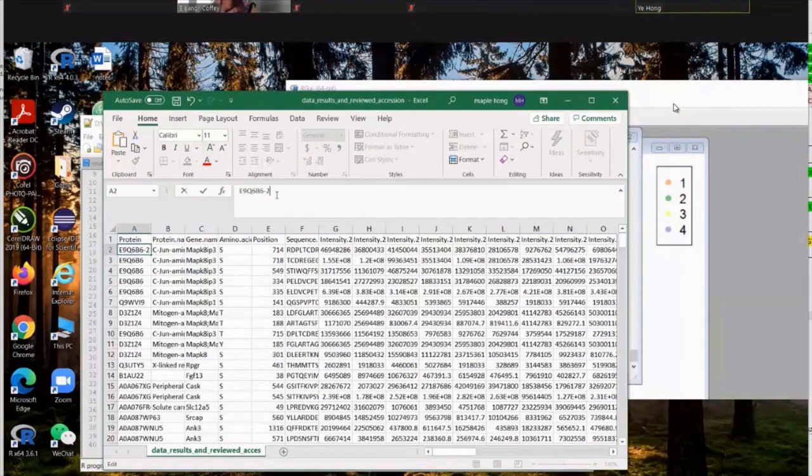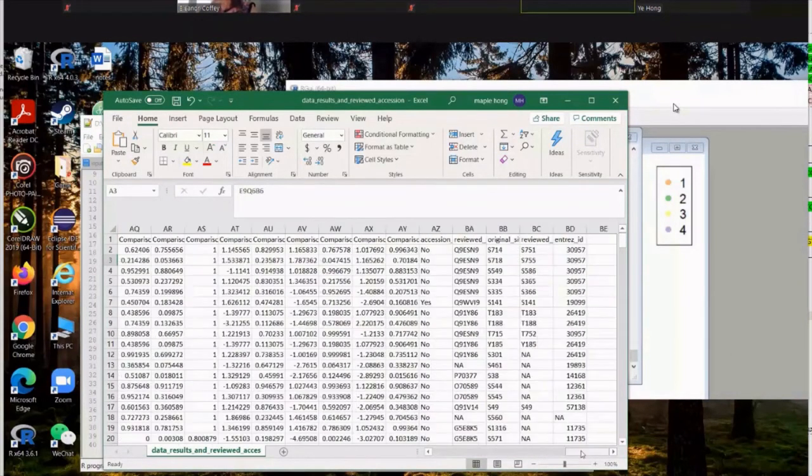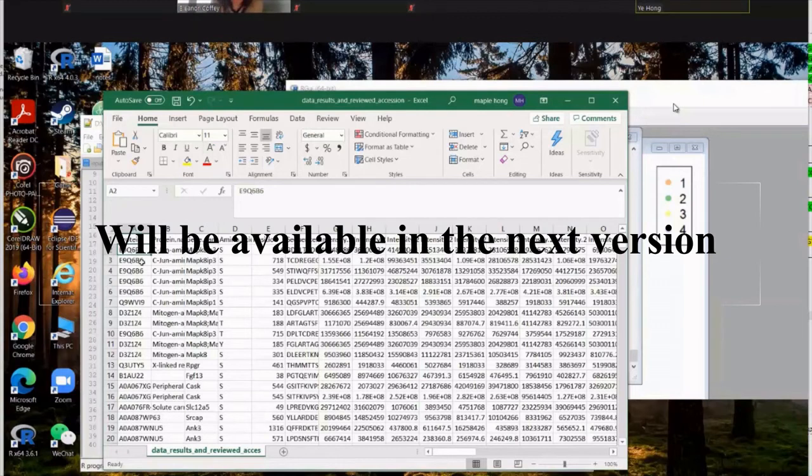So whenever I have to do this, I have to remove the isoform. I literally had to change it. I have a cleaning step for that, so it's unfortunate that I couldn't do that for isoforms. Is it possible to have some kind of warning column about this? Yes, I think that's a very good idea. I will make a warning column to say whether it's an isoform.